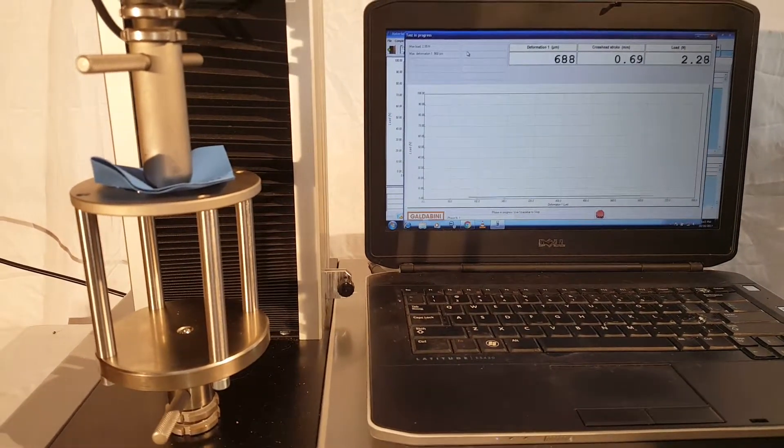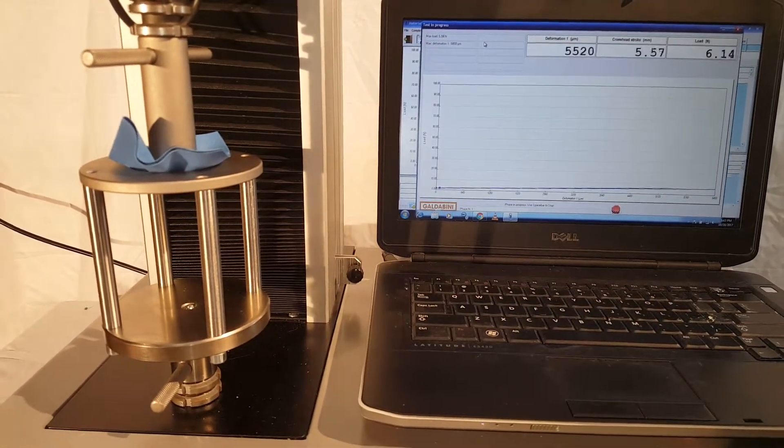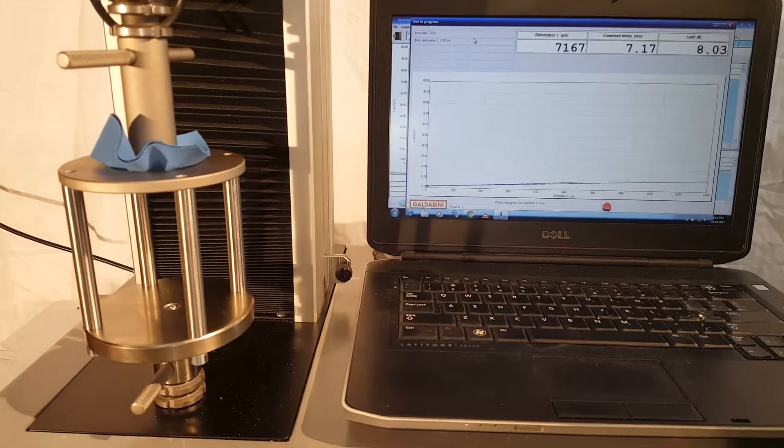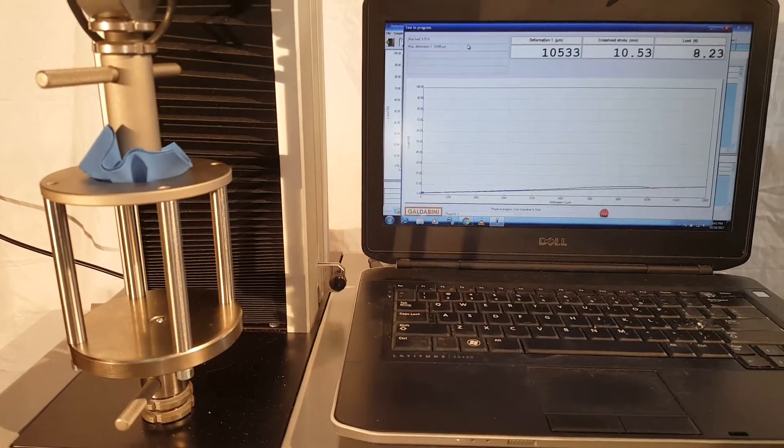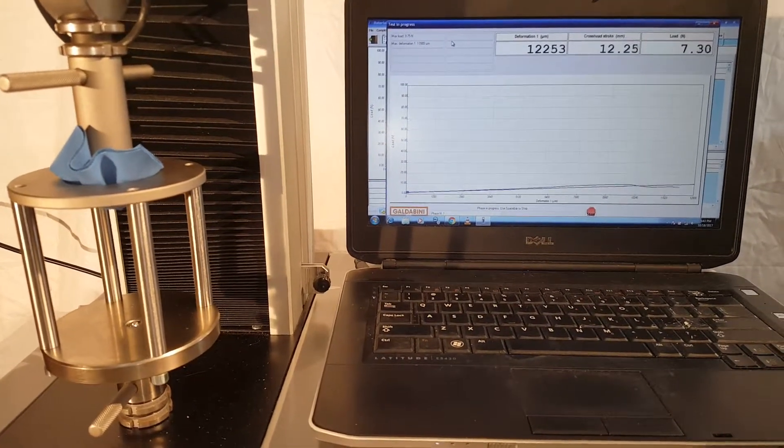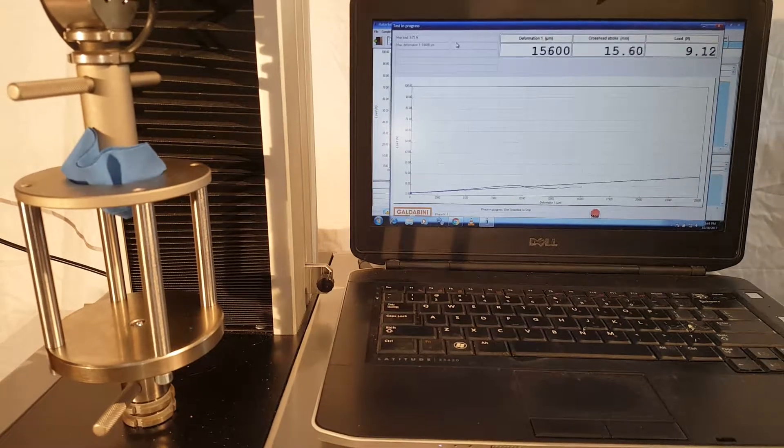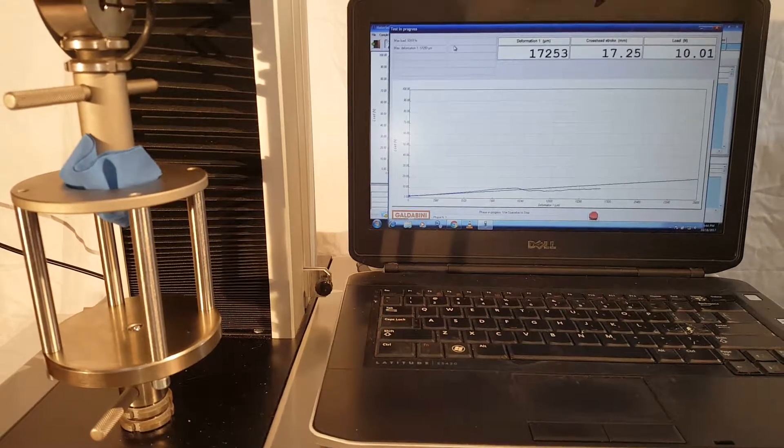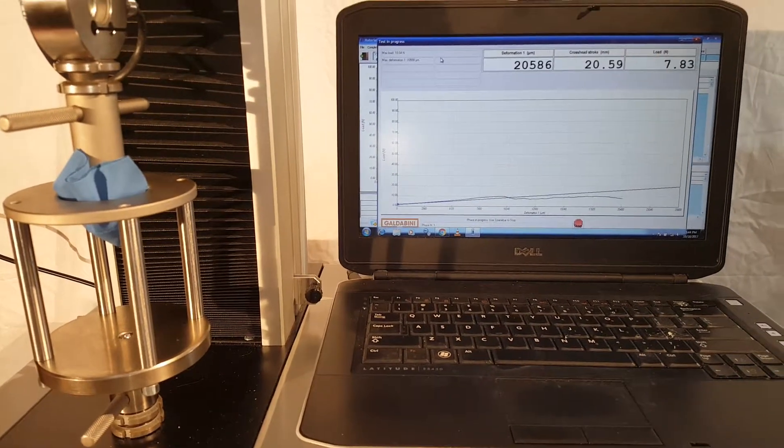All right. So here we are. We're pushing the sample through the fixture. As it does that, the load increases. You can see the load curve there.